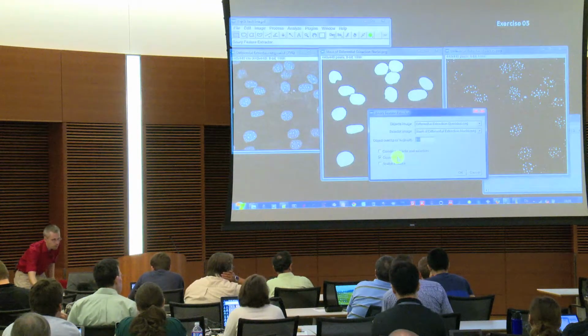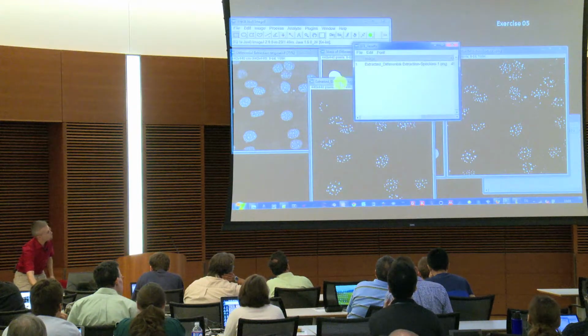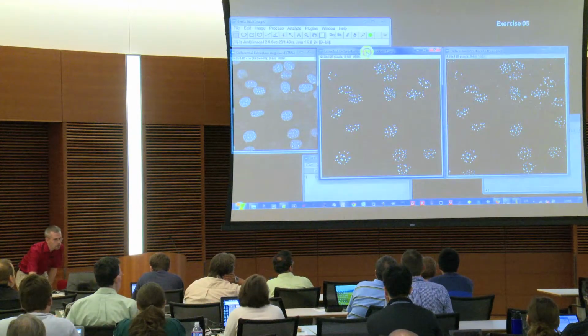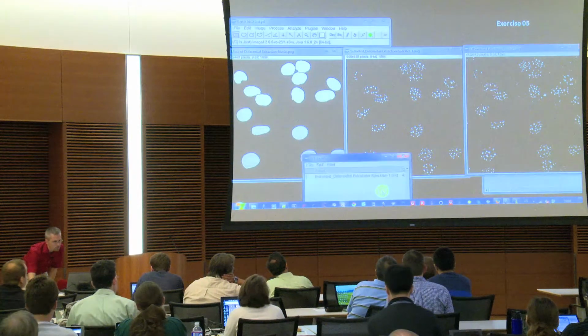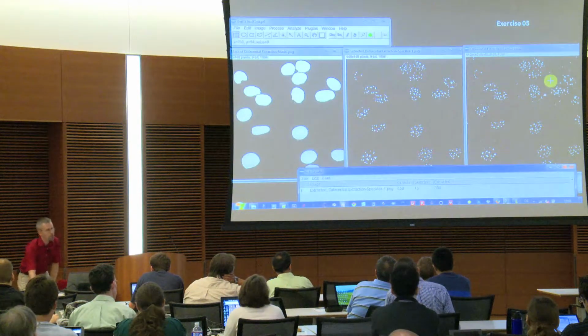And we can have a look at the count output. If I now press OK, you see that I get only those speckles from that image which are inside these ones. Okay? And I get the results table which tells me my original objects.